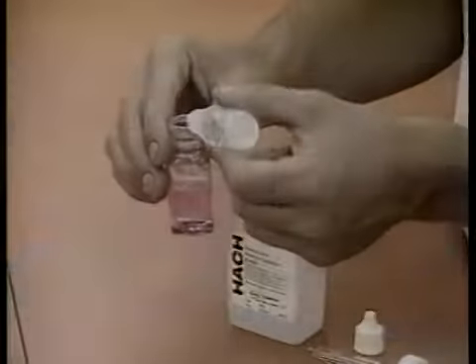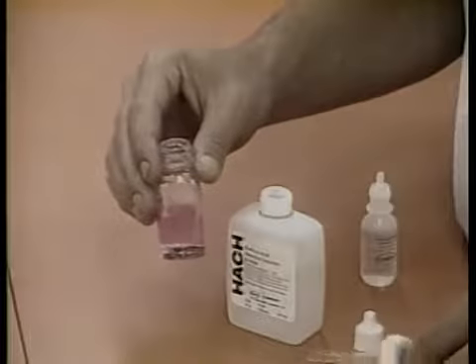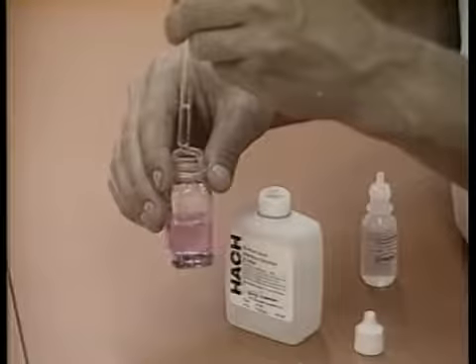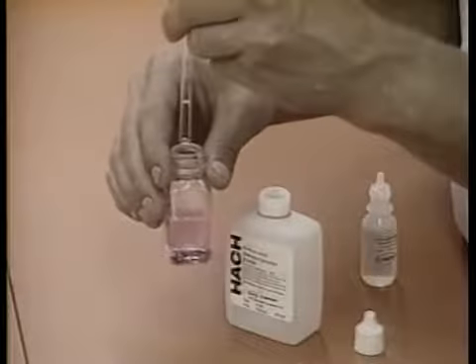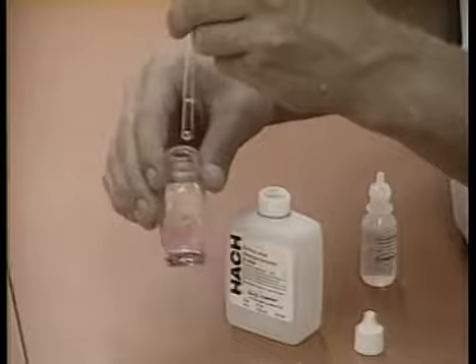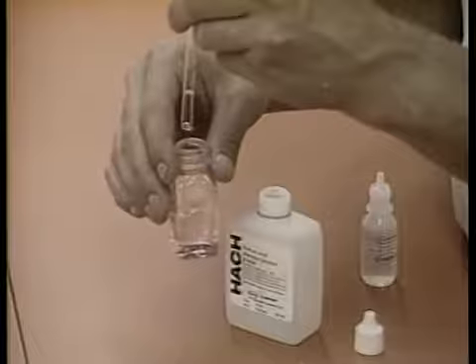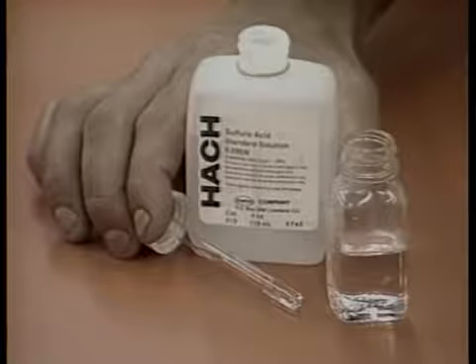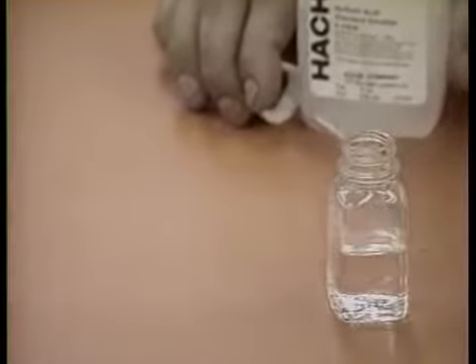If the water remains colorless after the addition of the phenolphthalein indicator solution, the phenolphthalein alkalinity is 0. However, if the water becomes pink, add sulfuric acid solution using the dropper drop by drop to the sample, swirling after each drop. The solution will turn pink only if the pH of water is above 8.3. Phenolphthalein measures resistance to pH changes above 8.3. Count each drop as you add it. The dropper should be held vertically while dispensing drops. Add the sulfuric acid until the sample becomes colorless and record the number of drops dispensed. Remember, if the sample did not turn pink after the addition of phenolphthalein indicator, no sulfuric acid should be added. In this case, the drops of sulfuric acid used to this point is 0.